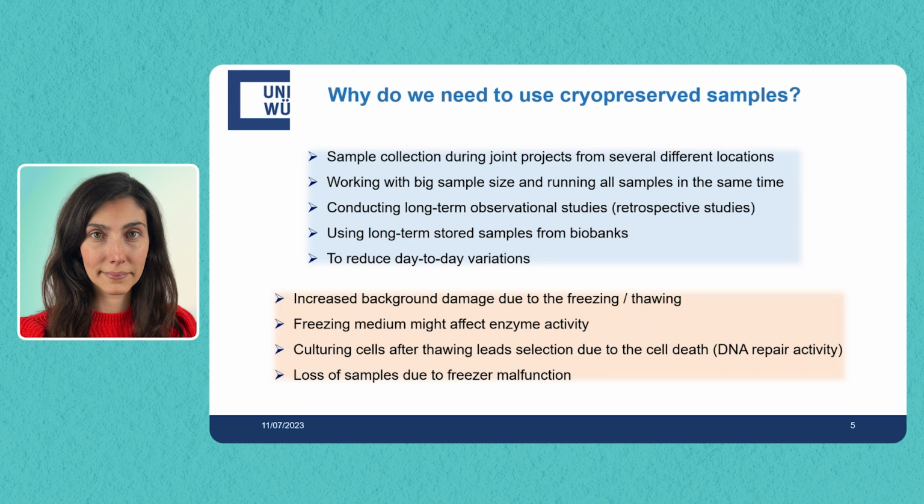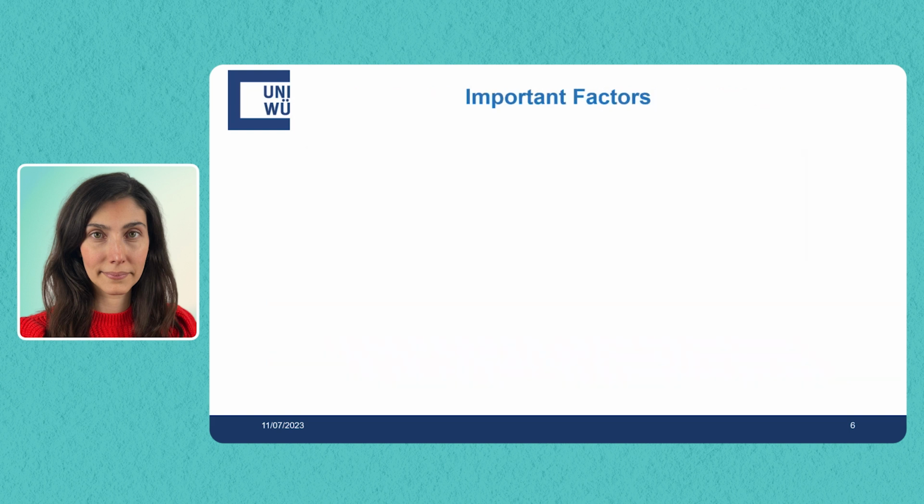And of course, it's a facility question actually, because for keeping long-term stored samples, you need liquid nitrogen, or you need -80 or -70 meanwhile to save electricity. However, it should be stable. It can also occur from time to time that you have a freezer malfunction and you lose your samples. So it's also not so easy in that sense.